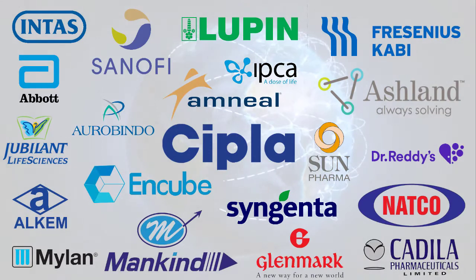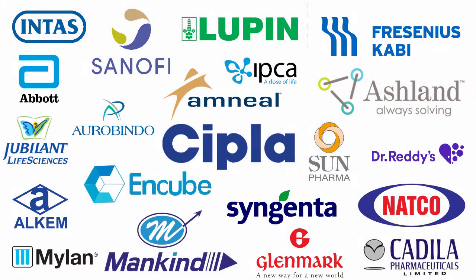Large numbers of customers across the globe have used and endorsed ipvAutoClass as a complete system for particle size analysis and particle classification.